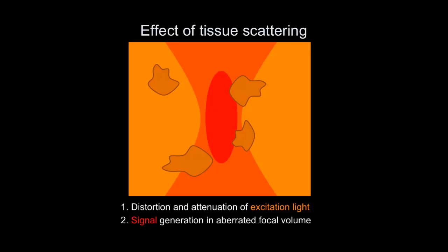That's a very different condition than in a non-scattering tissue. Okay, so on the level of the excitation light, I'm starting to mix things up. I'm affecting my situation. That has a consequence for how much signal you generate. And then finally, the signal that is generated has to propagate out of the tissue. Okay? So the photons will only be generated here, let's say. They have to propagate out of the tissue, but they will encounter also the scattering objects, and therefore will be, at some point, not ballistic anymore. Okay? So the propagation of the signal out of the tissue is also of interest here.